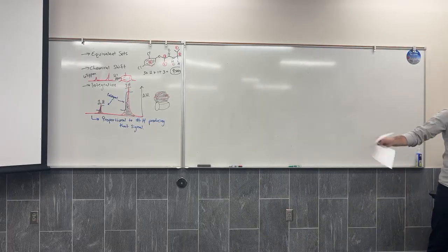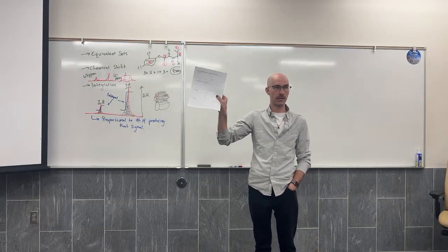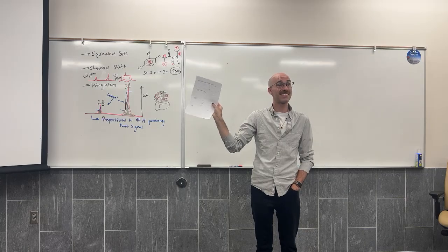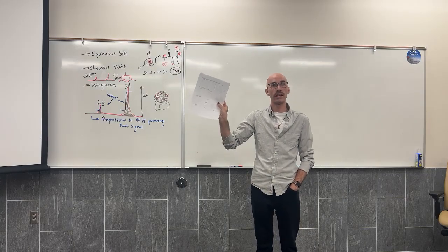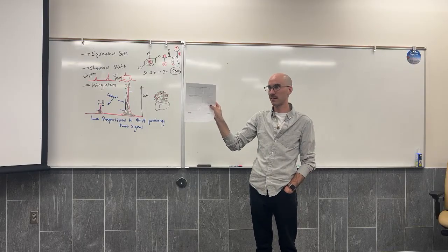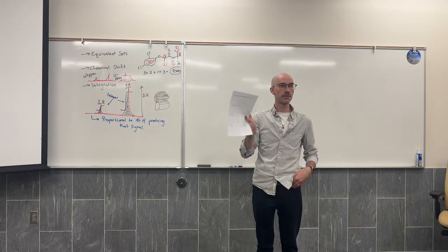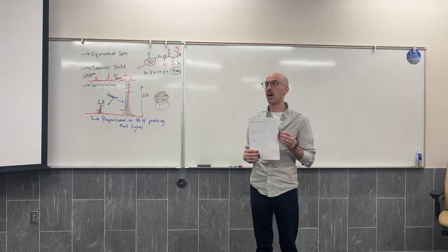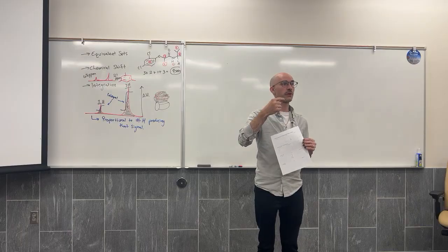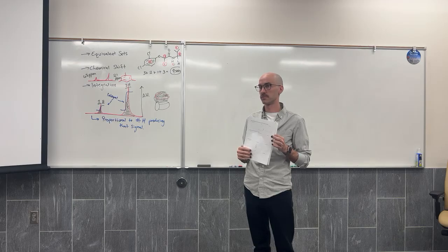By the way, all of the spectra that you're looking at is real experimental data, literature data, published data. There are simulators out there where you can simulate an NMR spectrum based on what it expects the signals would be. I'll never give you those. I'll only ever give you real data. And the real data doesn't come with integral lines or with integration numbers. I always add those integration numbers on there, unless the question is asking you to figure out what integration a signal should have based on a structure given to you.